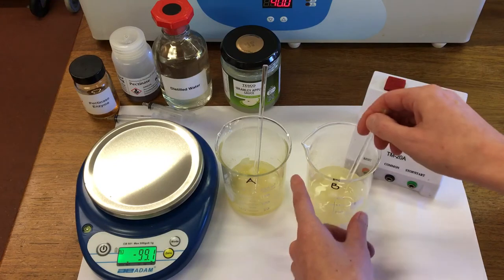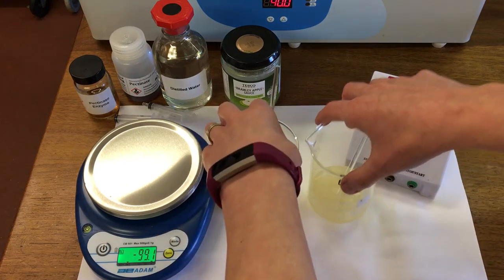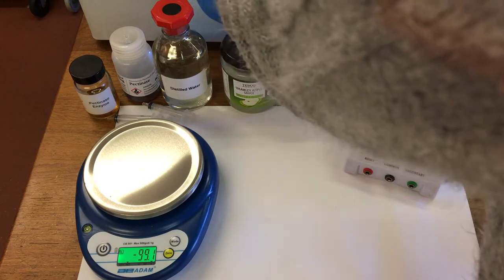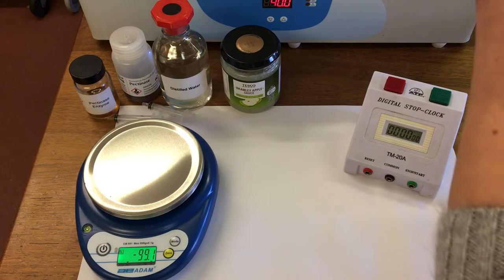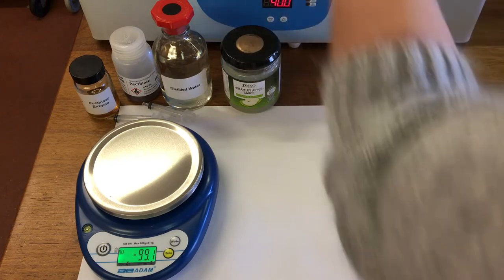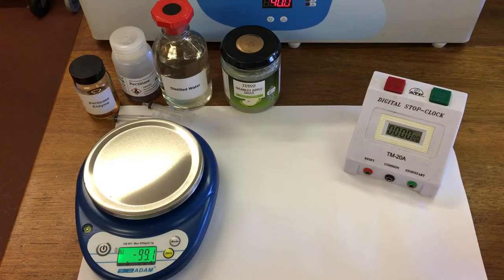And then we're going to place them in a water bath to allow the enzyme to work for 15 minutes at 40 degrees. So I'm going to pop these two into the water bath. And then I've got 2 here that have already been in for 15 minutes.